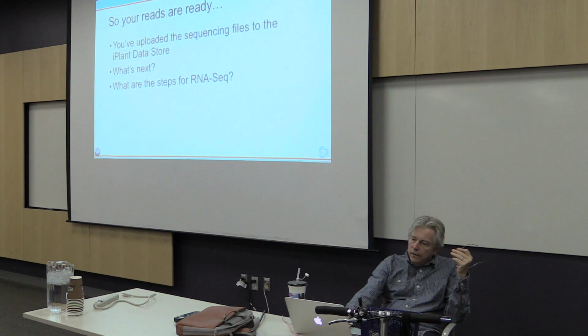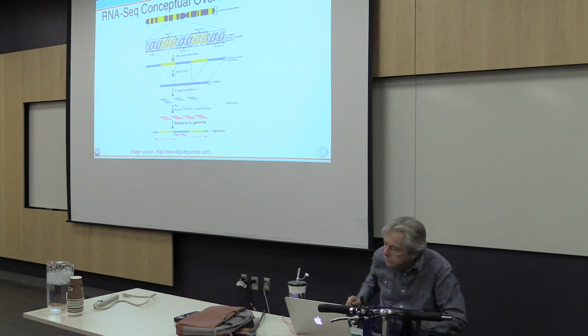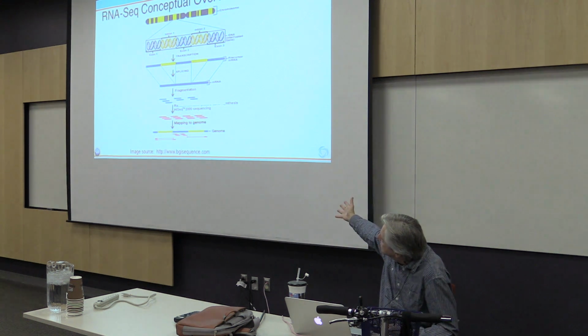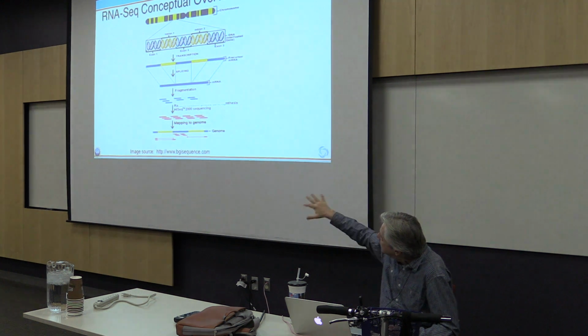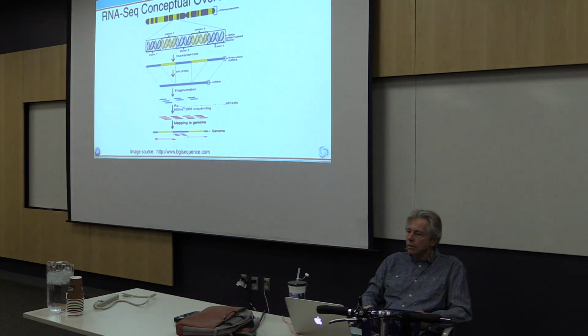So then it just comes down to, what do you do? I mean, how do you do RNA-seq at iPlant? And this again comes down to the different steps, but we've already talked about what we're looking at as far as transcription, the sequencing process. Ultimately, we're going to be looking at fragmented reads, and supposedly those are in the data store.